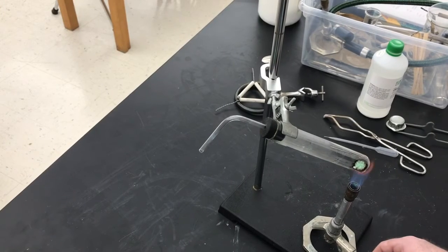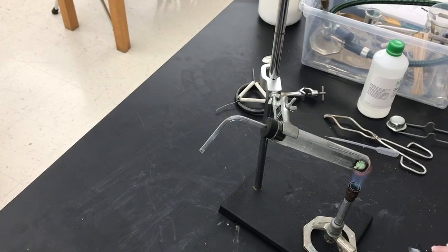Now, what we also might notice is that on the other end here, on the business end down here, we see that the copper 2 carbonate has turned color. It sort of looks like it's burning. It's not really burning. It is reacting, but I wouldn't say that it's burning. But it does sort of look like that.